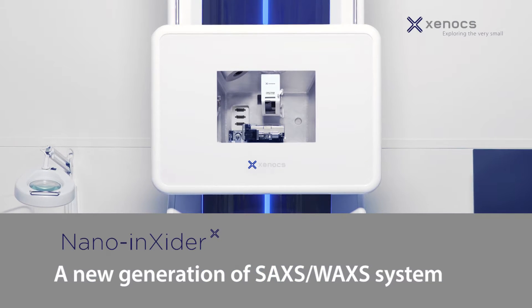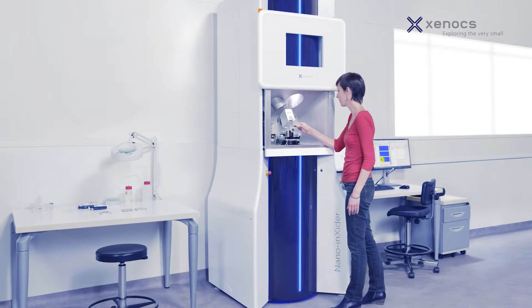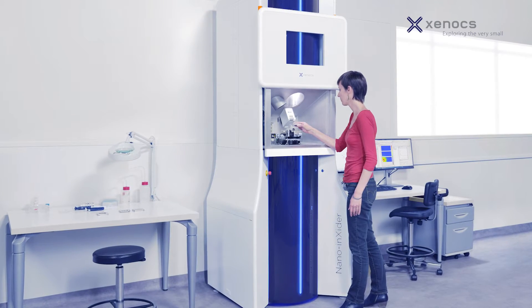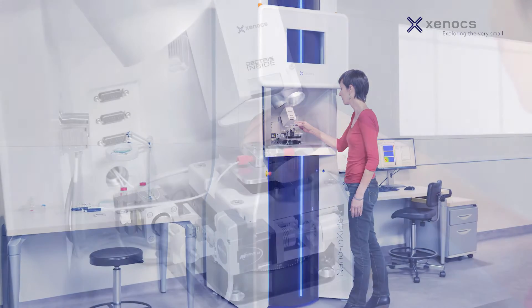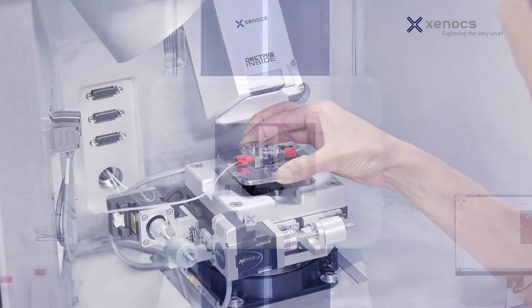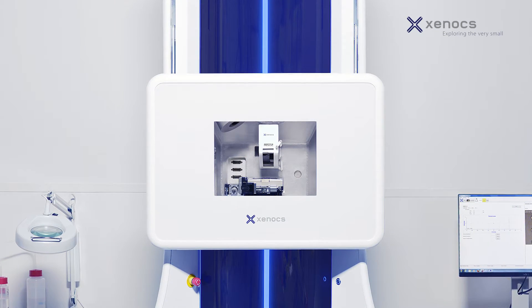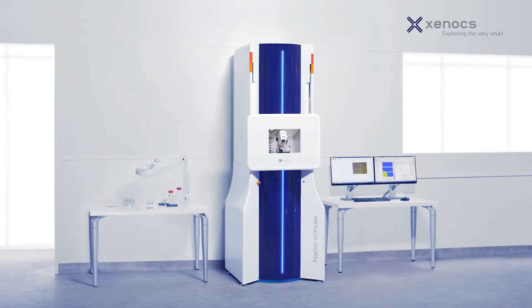Introducing the Nano-inXider from Xenocs, a comprehensive solution for the characterization of nanomaterials. Benefiting from the unique technology developed for the Xeuss 2.0, the Nano-inXider features unparalleled performance and ease of use in a compact package for simple integration into any lab environment.